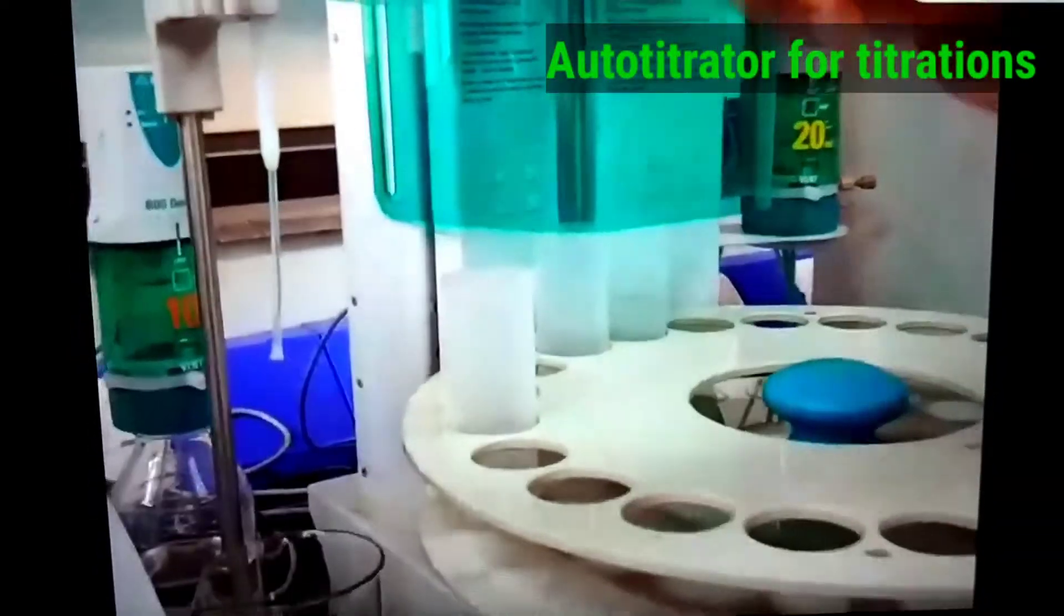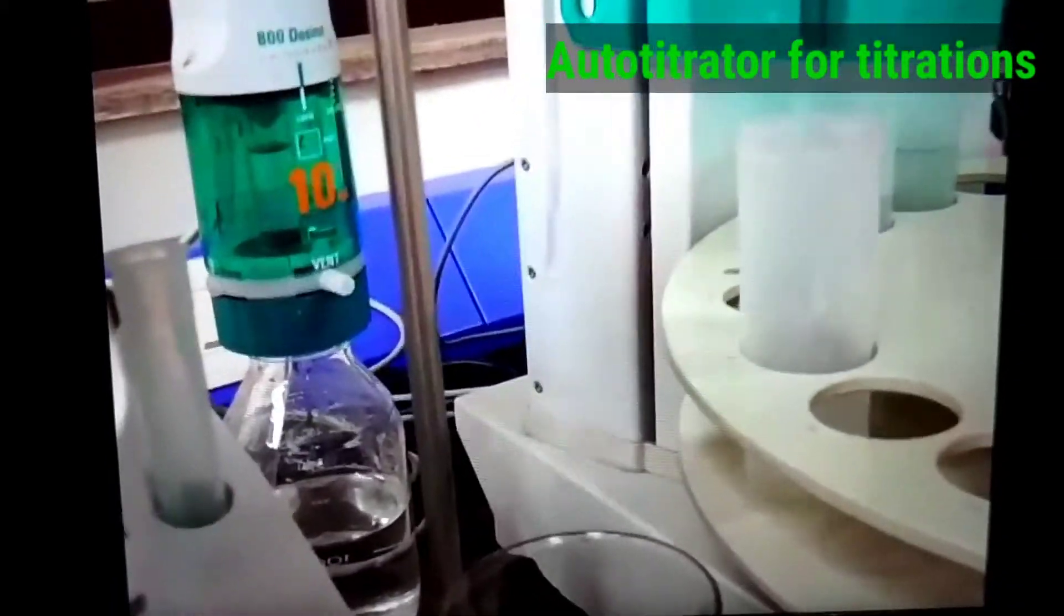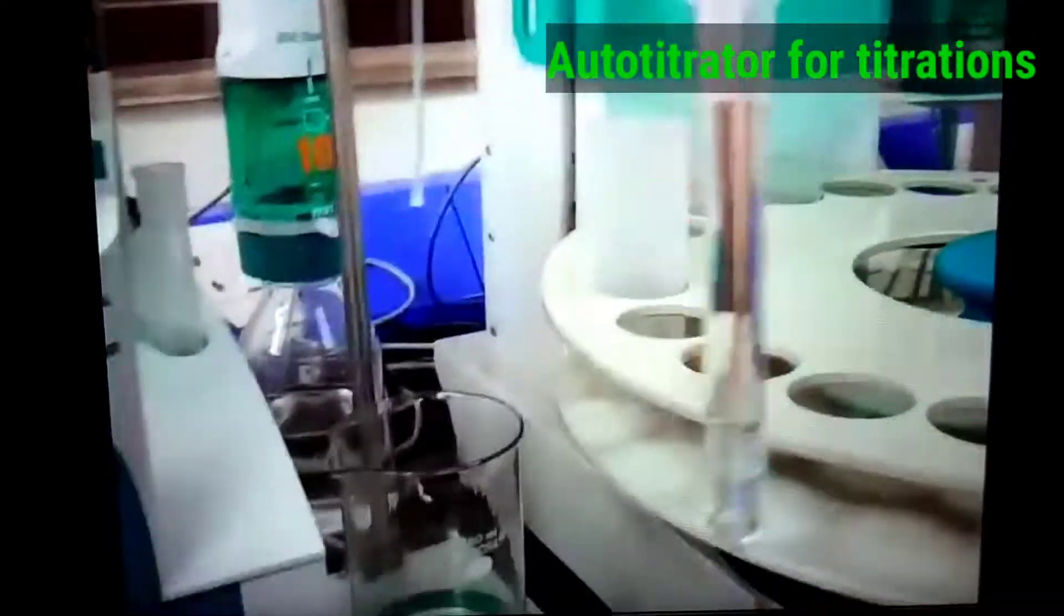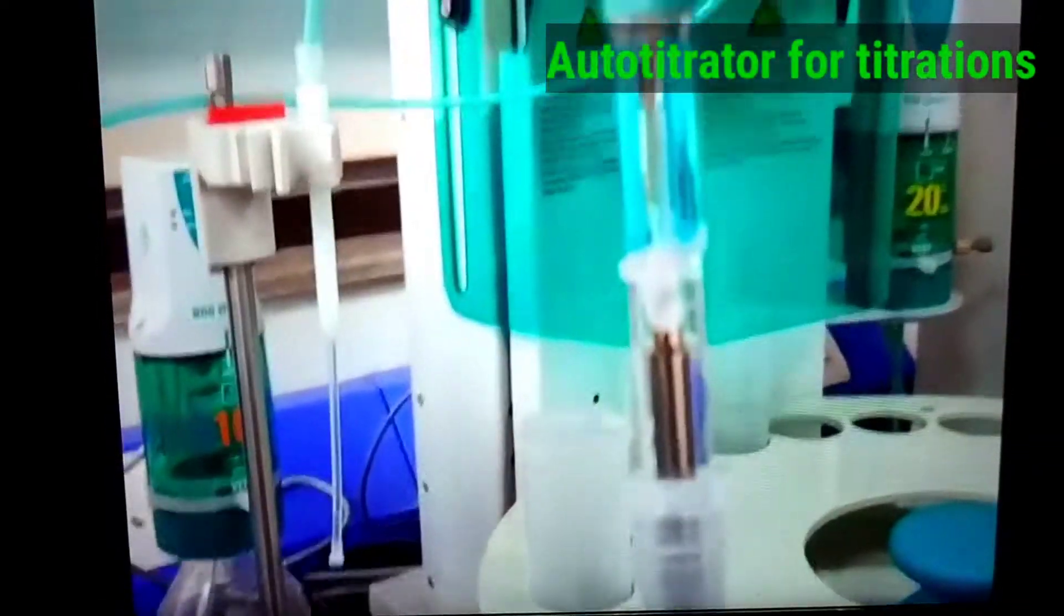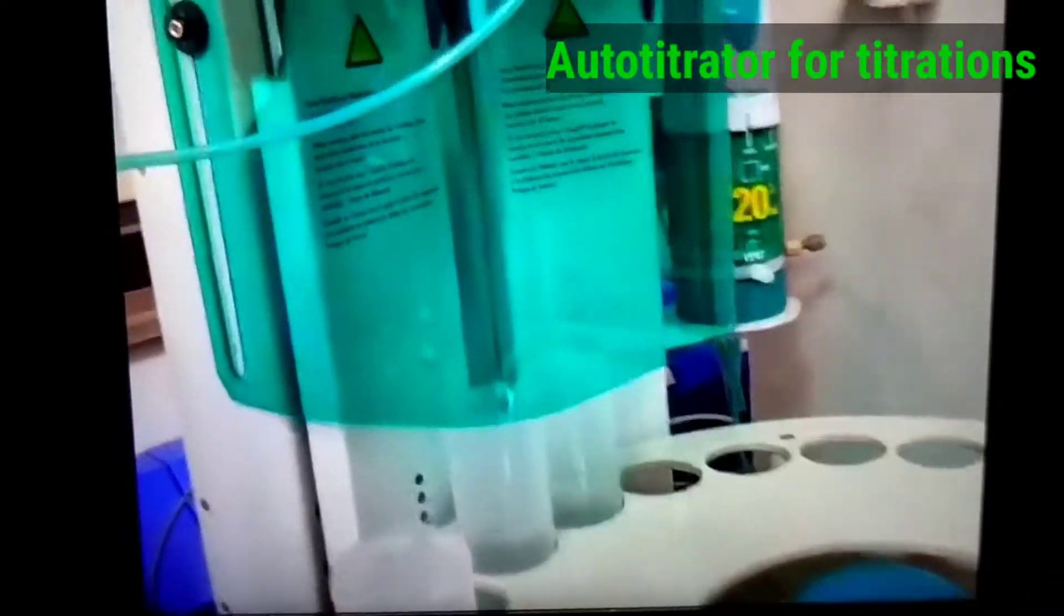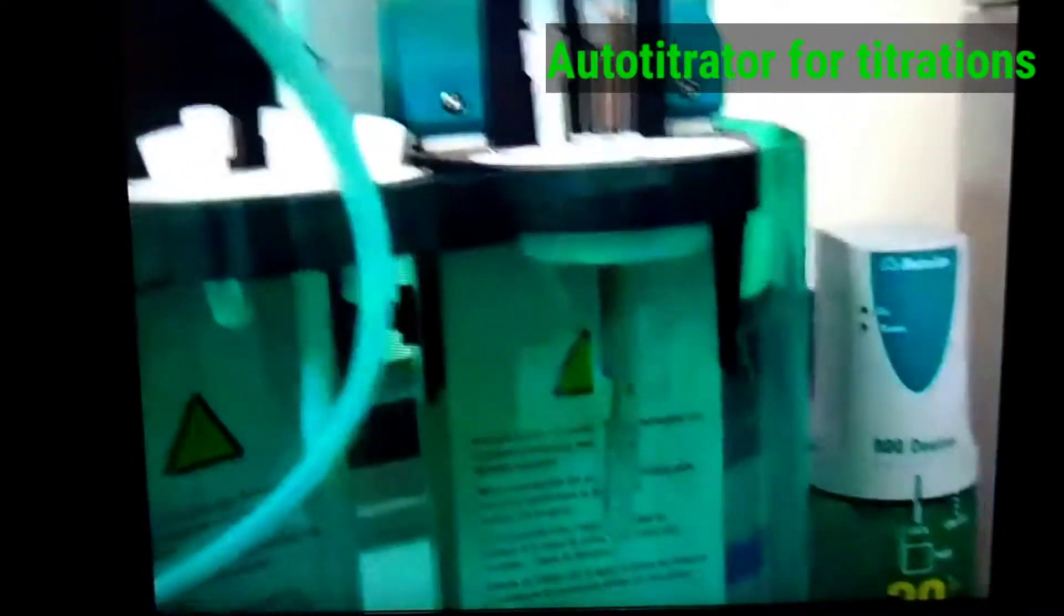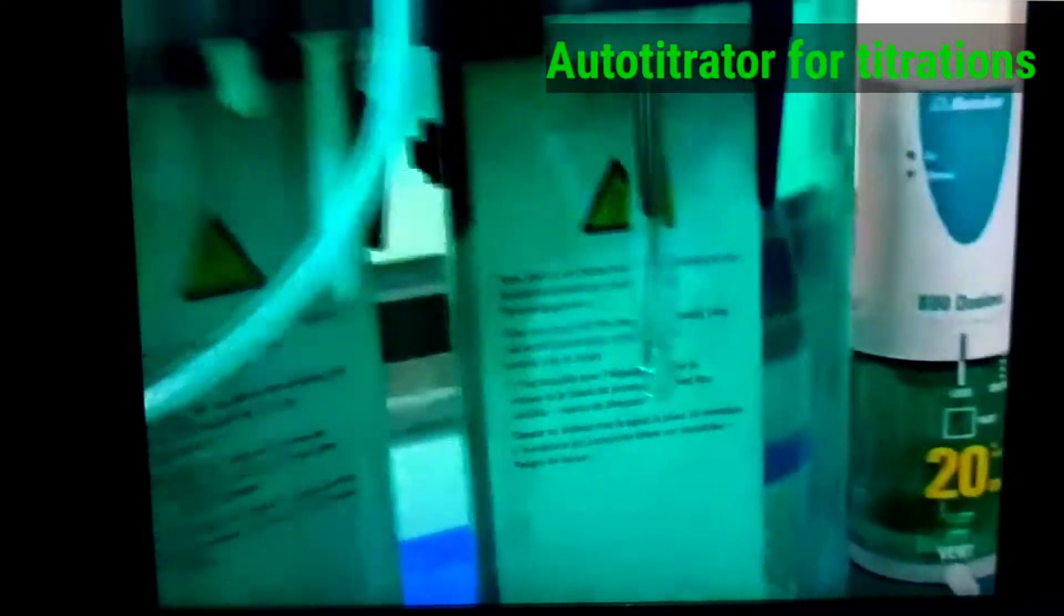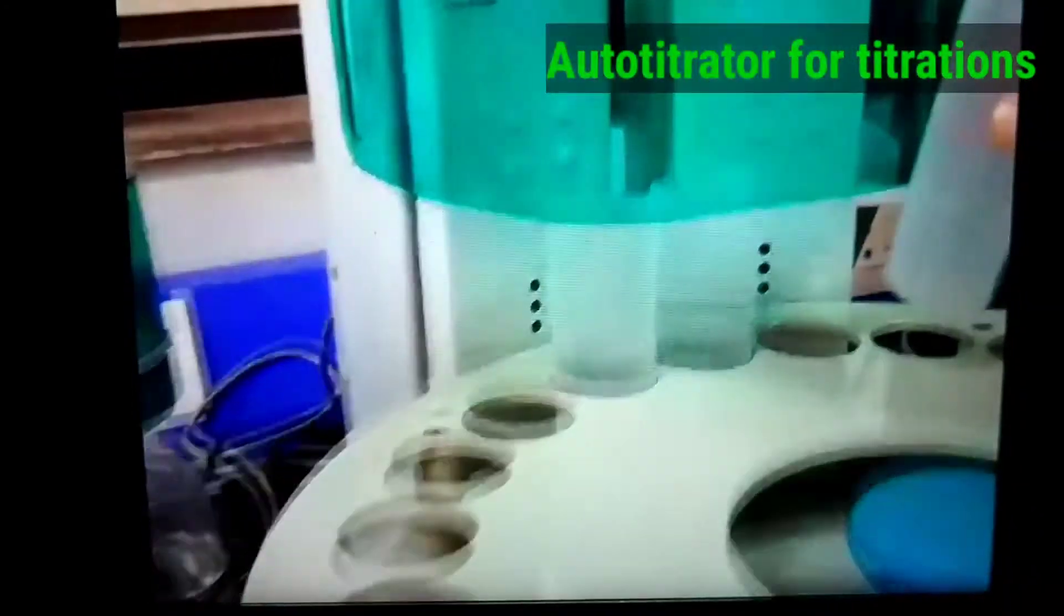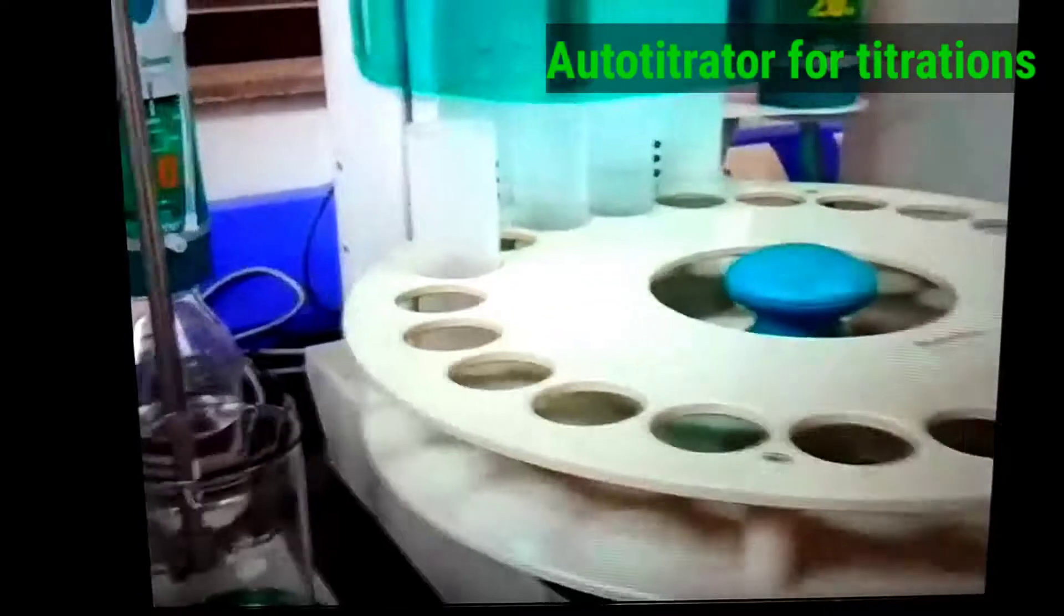Then we have a pH electrode like this. Just focus it. So you will put this pH electrode here like this, and you will put the sample downward like this in this one.